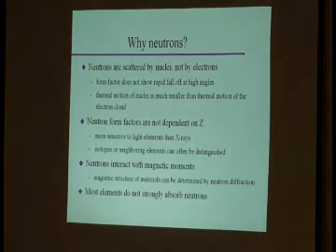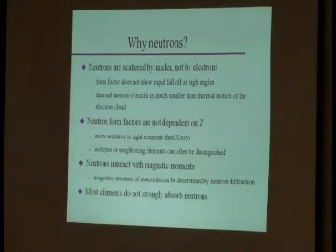Now, why would people use neutrons? Looks like it's a heck of a lot more effort to produce neutrons than it is to produce X-rays, right? And for that matter, you have all kinds of safety issues around neutron reactors. However, they do give you a lot of advantages in some experiments.